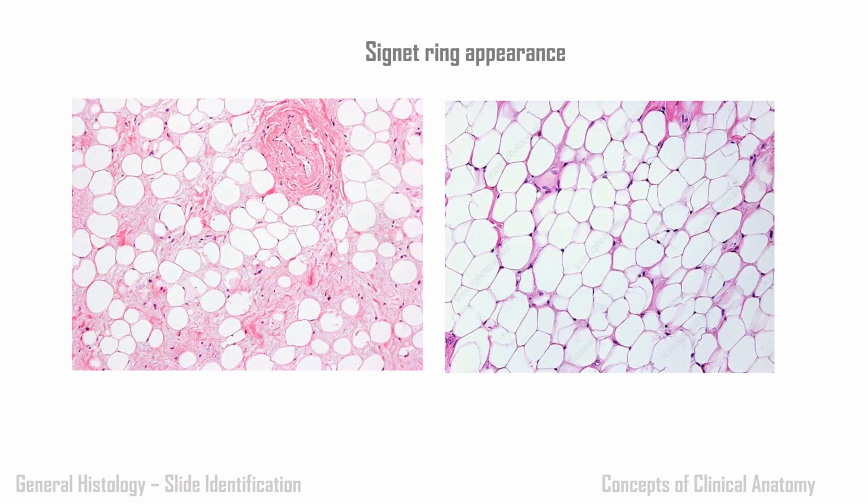The next thing we'll see is connective tissue, that is only the adipose tissue, as dense regular we have seen with the white fibrous cartilage. In the adipose tissue, this is a cell which contains a single large vesicle of fat. All the cytoplasmic content including the cell organelles is pushed to the periphery. You can see these are the nuclei in the periphery. It's like a signet ring appearance. This is the classical feature of adipose tissue.